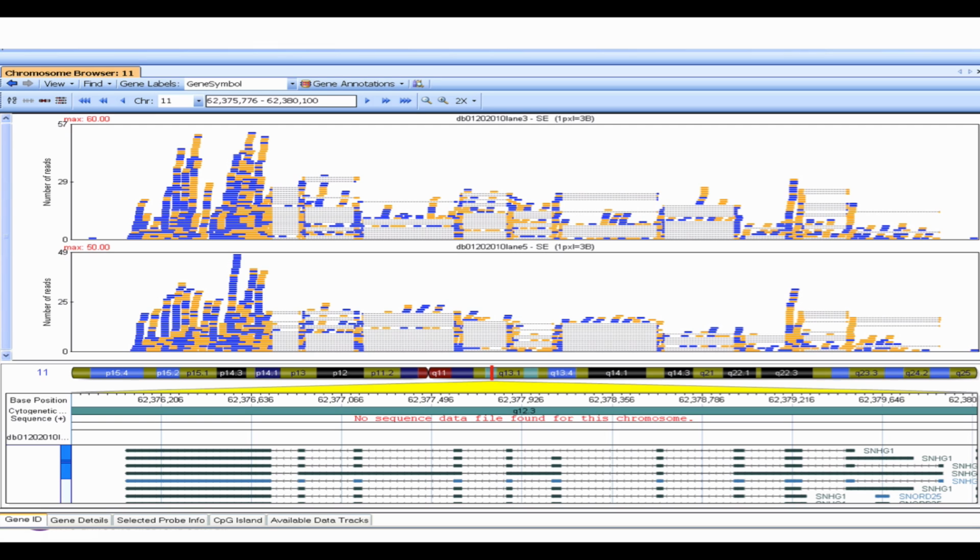But what's nice about this is if you get a differentially expressed gene showing up in your statistical test, you can go back, load your aligned files, they're called BAM, I'll get to that later, into the genome viewer, zoom in on the gene that was described as differential, load both samples and see if there really is a difference between those two samples that satisfies you on sort of a personal aesthetic level that yes, this gene is differentially expressed in a functionally meaningful way, even if the fold change is 1.1 and the p-value is 0.04.